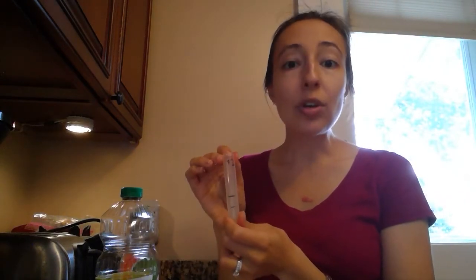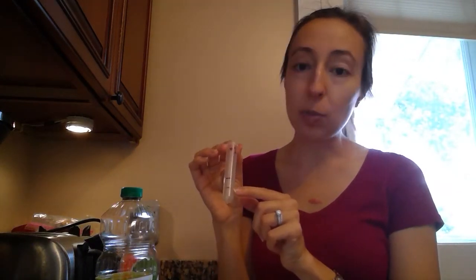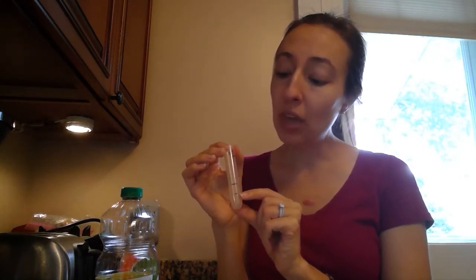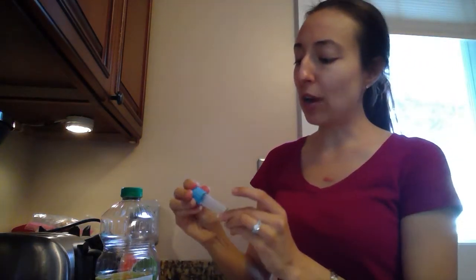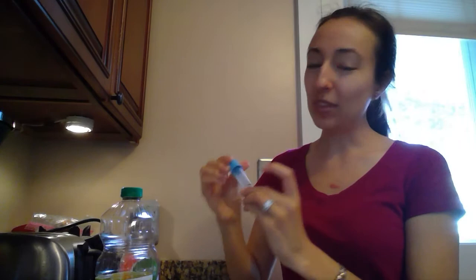Now in the first test tube number 1, you're going to add your vegetable oil up to your first mark. So whatever vegetable oil you're using, go up to that very first line, and then you're going to fill it up to the second line with water. Now you can have your caps around. They're not the tightest. So I actually have a little container that I can put them in so my test tubes don't spill out. So maybe you want something like that.